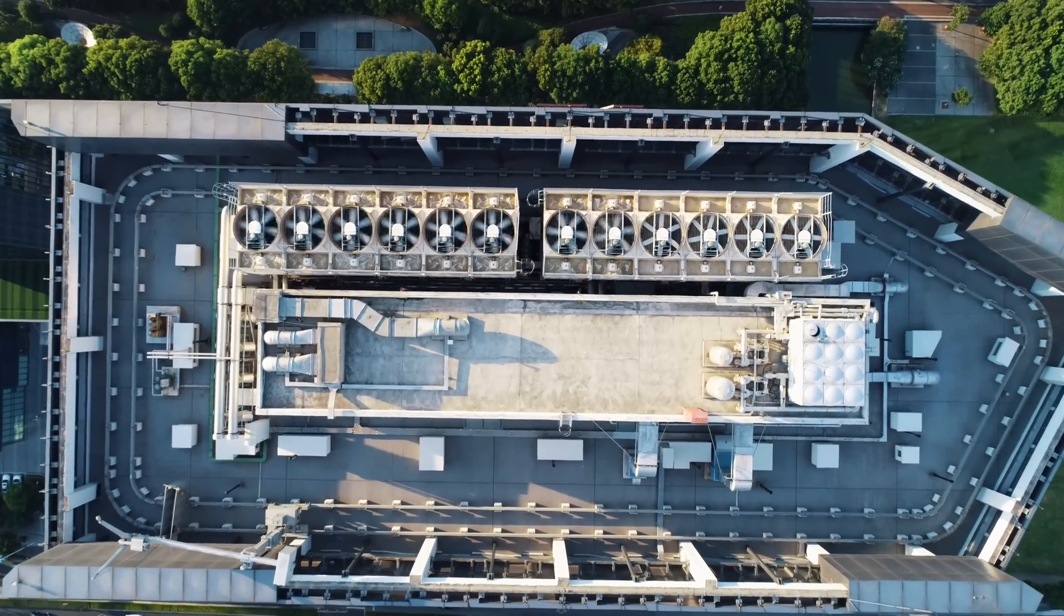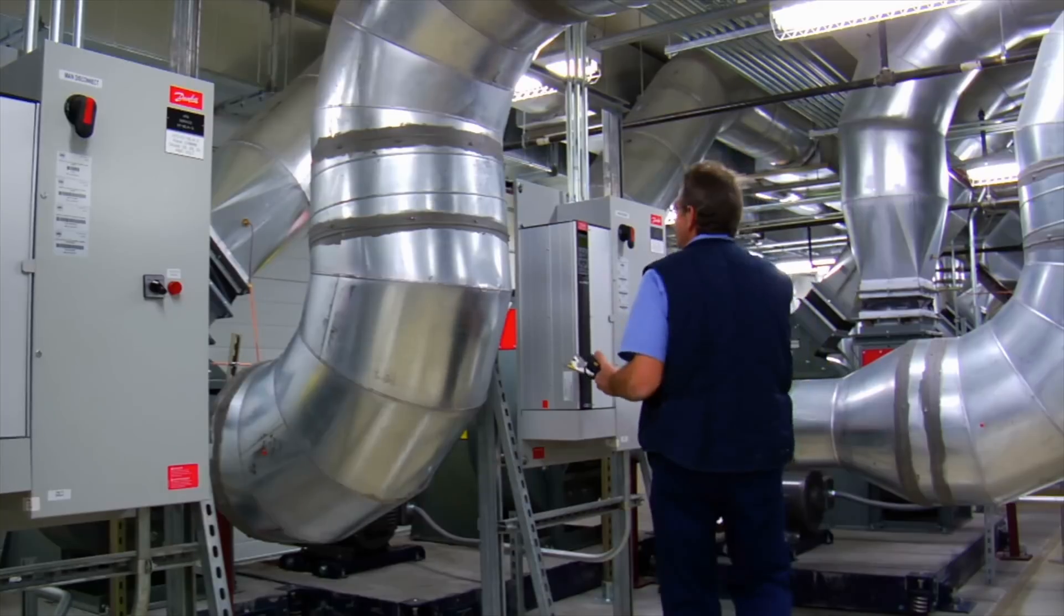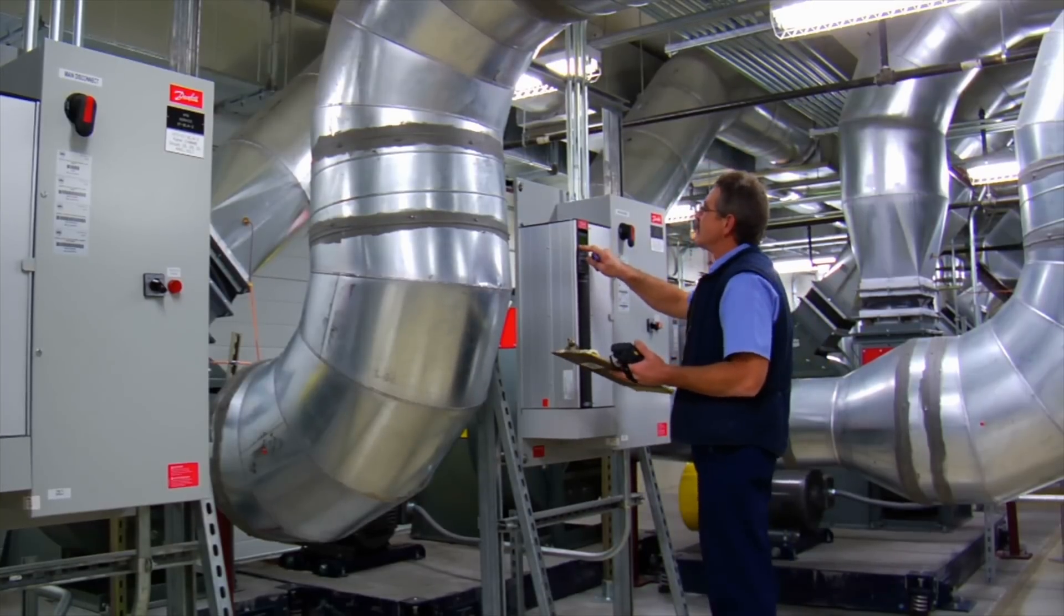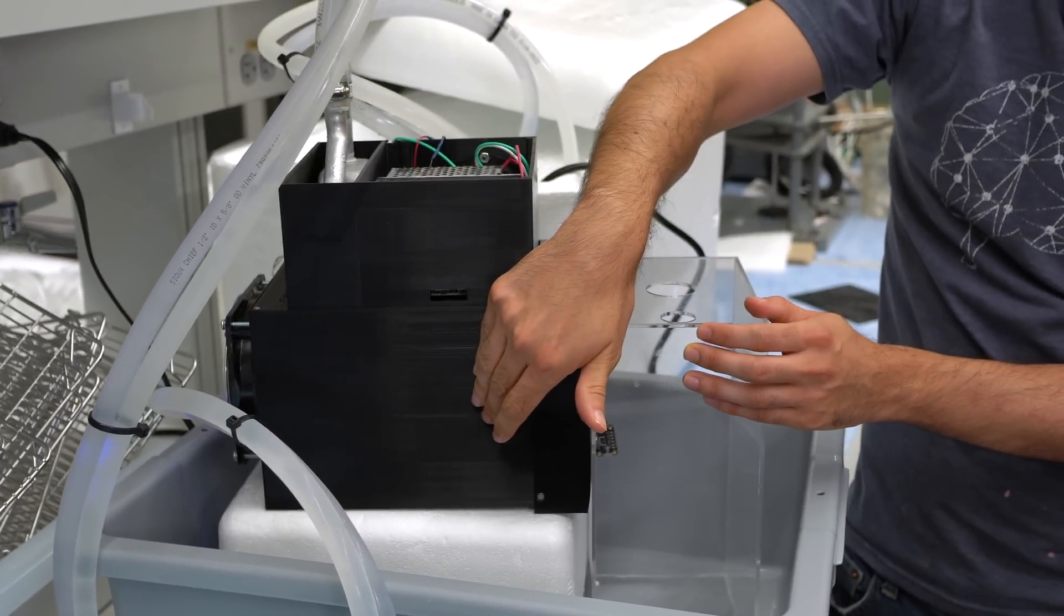I'm not a heating and cooling expert by any means. Can you explain how you thought up to use like the car radiator part and all that? Well, I used to work for a HVAC company when Phelan was a newborn in Texas. And so it's routine that a commercial building like the one you're standing in has air handlers that provide air at the desired temperature and humidity. So what I have built is just a shrunk version of those.